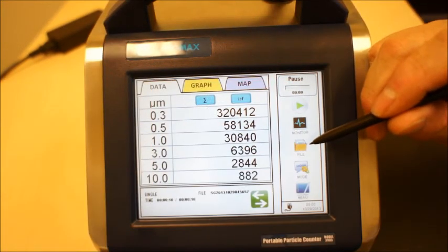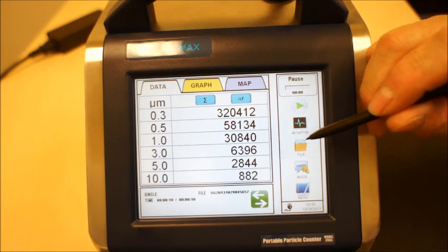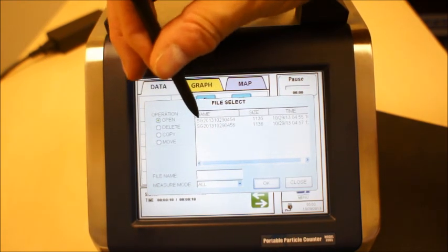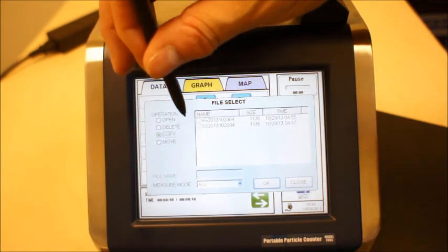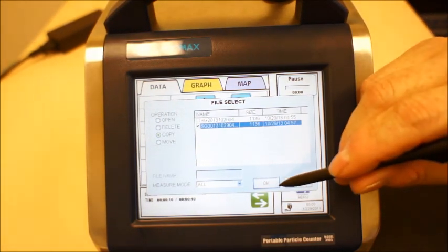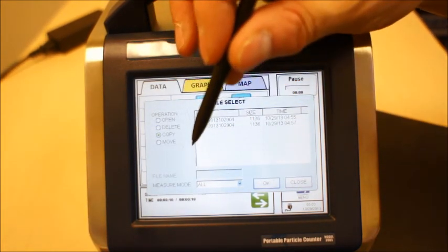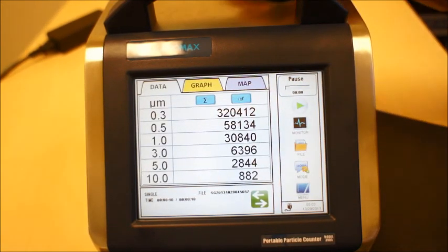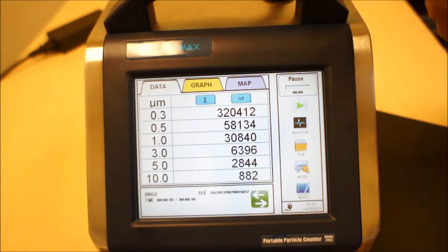This is a representation of how you can actually take the data from the instrument by flash drive. You open the file, choose the file name, copy — okay — when the file is copied, you can close. And the data is saved on the flash drive.